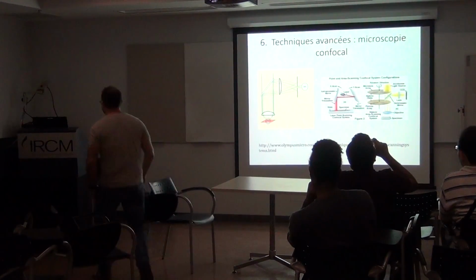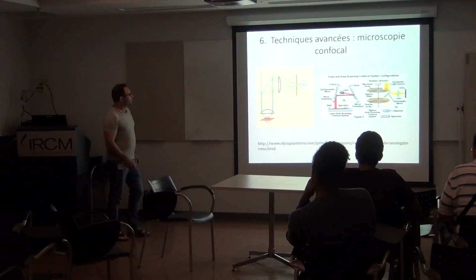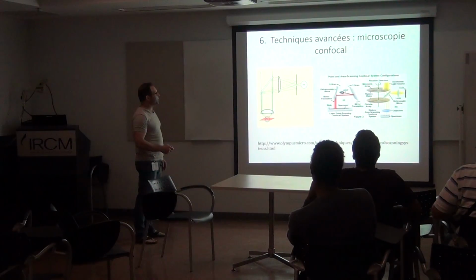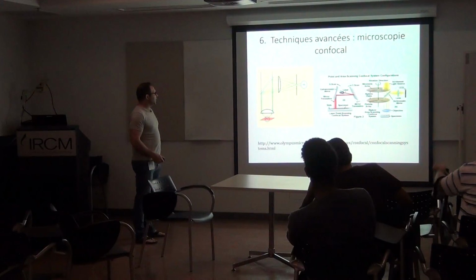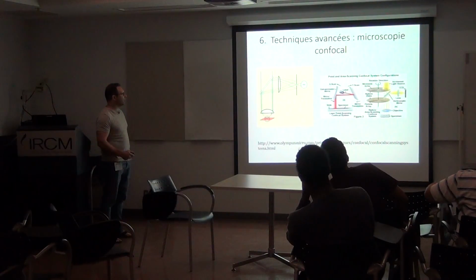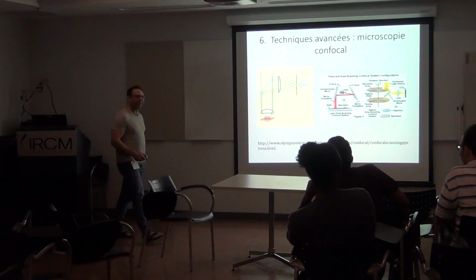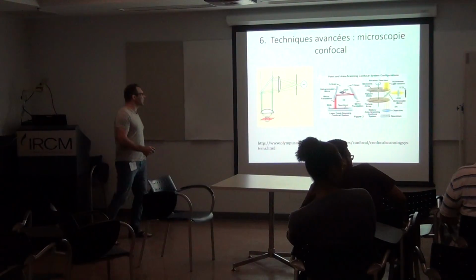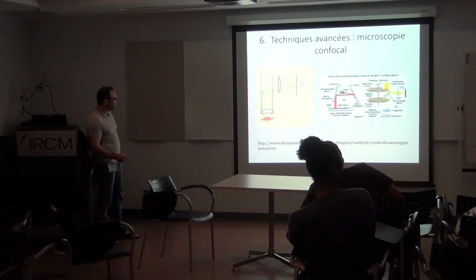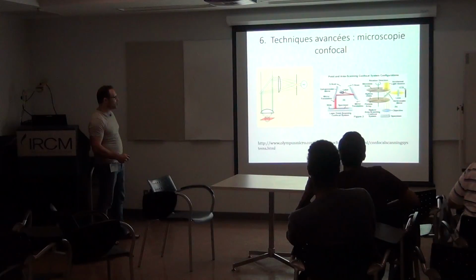So, advanced techniques, which confocal microscopy is part of. So, what is confocal microscopy? Confocal is just, it uses an aperture.